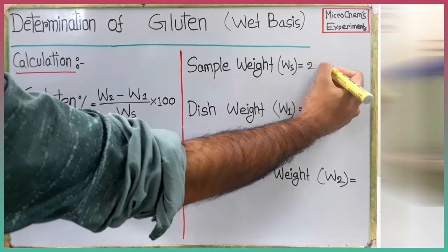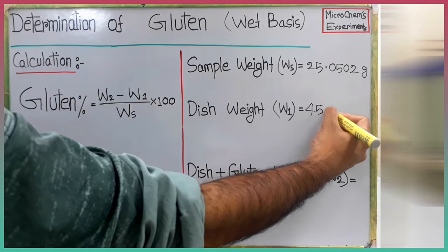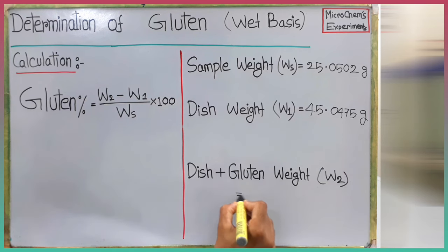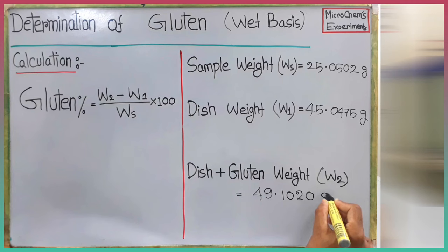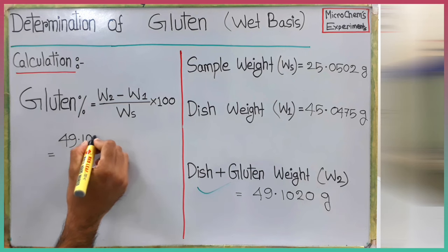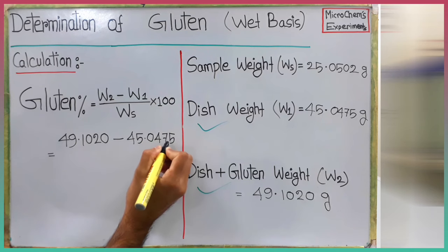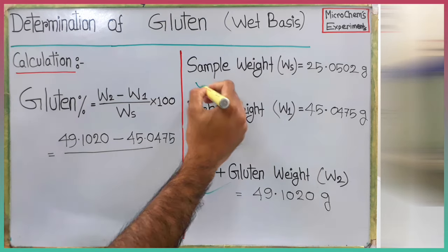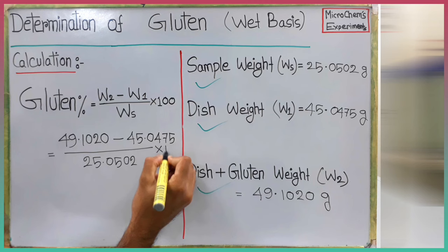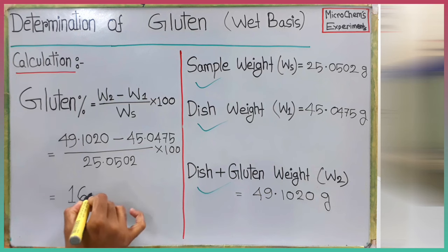Sample weight WS is 25.0502 grams. Dish weight W1 is 45.0475 grams. Dish with gluten weight W2 is 49.1020 grams. Let's put the values in the left side of the board. By solving the equation, we get the gluten percent is 16.18.